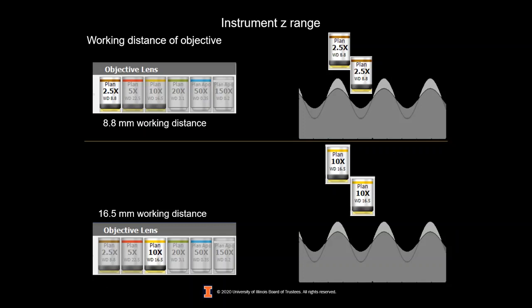And if your surface features are fairly large that you're interested in, and your main worry is that your sample is transparent, you can actually sprinkle something opaque on top, like baby powder even, if you've got very large features on your sample. Of course, that will start to affect things if you're trying to get really high resolution images of that top surface. But if you can make the top surface of your sample opaque, then that will work.